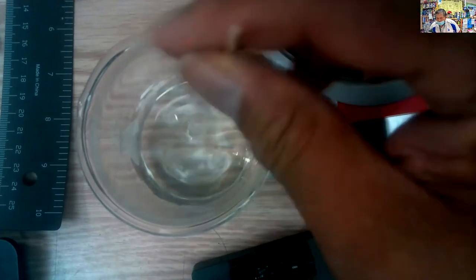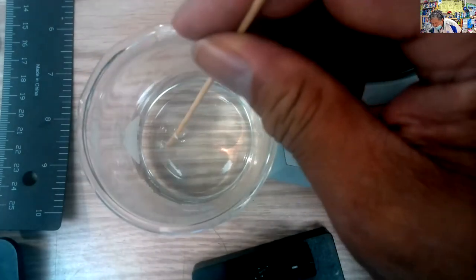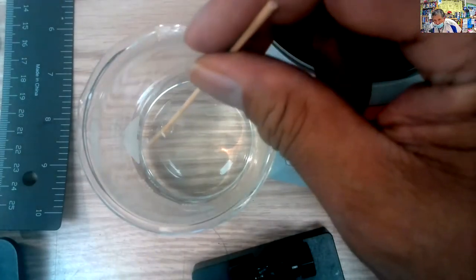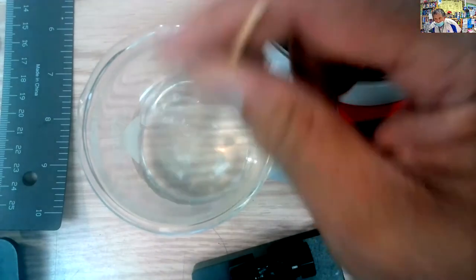So it's better if you have table salt, because those are smaller crystals and will dissolve quicker. But you don't even need this much. You just need a really small quantity. And so I can still see them right there. So hopefully we'll get those to dissolve.